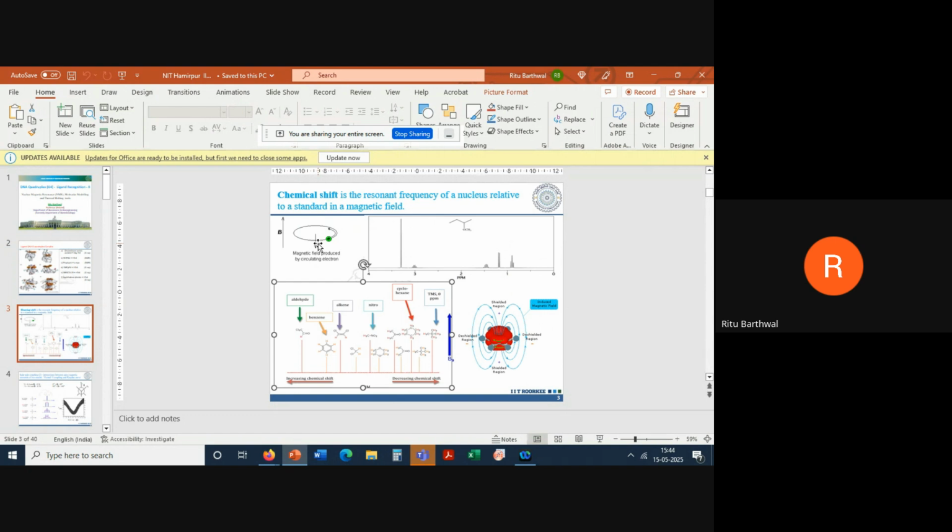And resonance will be there only and only, you will see this absorption when the intrinsic frequency of the proton in the magnetic field, by which it rotates around the magnetic field, matches with the external one. So there is a resonance, as we call it. So let's assume 11.7 Tesla, and if this is the magnetic field, the proton will resonate at 500 megahertz.